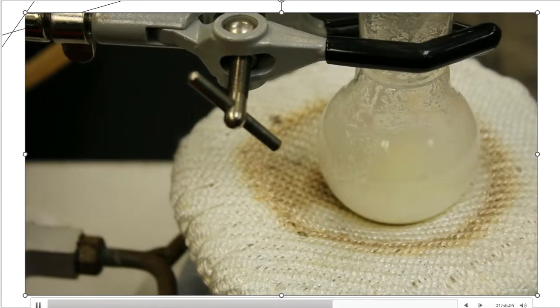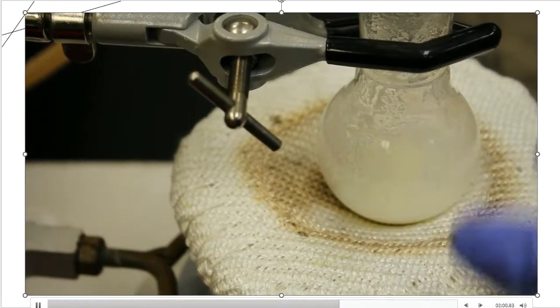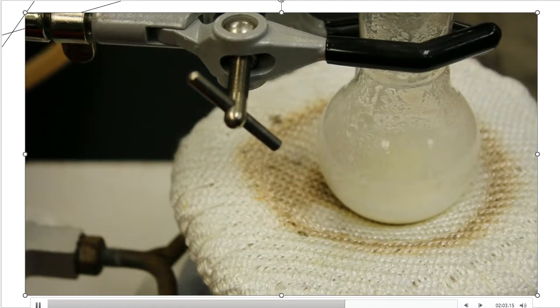Now we're going to add water, because if there's any extra, I want it gone before we go to the next step of the procedure.